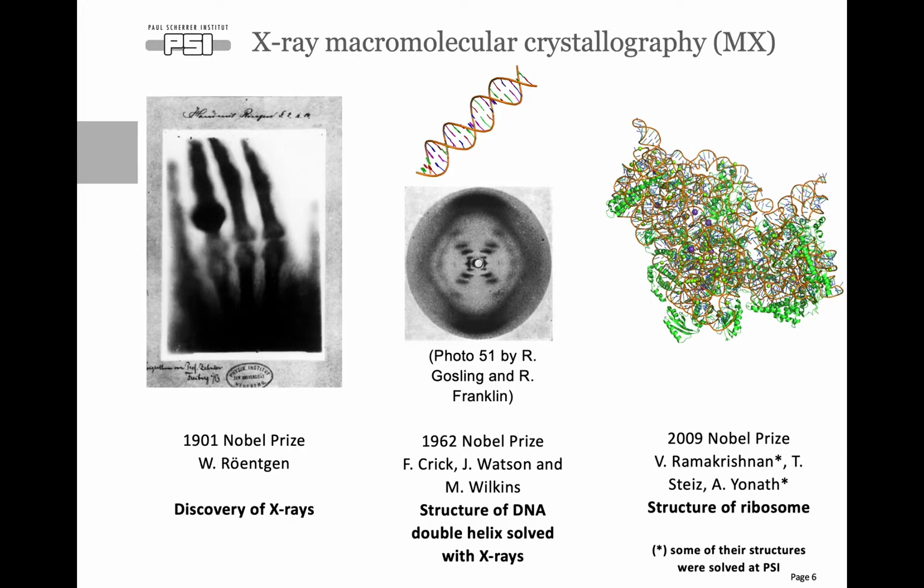X-rays are still very important to understand how living cells are doing their job. For example, just a few years ago, a Nobel Prize was given for a study of ribosome, and the structure of ribosome used by Nobel Prize winners was obtained with X-ray crystallography.